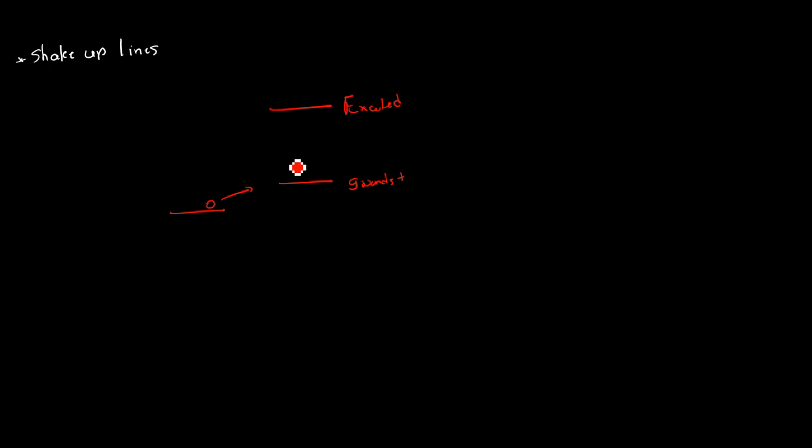Now what happens is some of our emitting electrons may contribute their energy to overcome this particular gap, to fill up this gap. So after all, when our electron comes to the detector, it has spent more energy than usual. Based on our equation, the kinetic energy is h nu minus binding energy and correction factor, and in addition to these terms, it has spent another term of energy on this excited state to ground state energy gap.